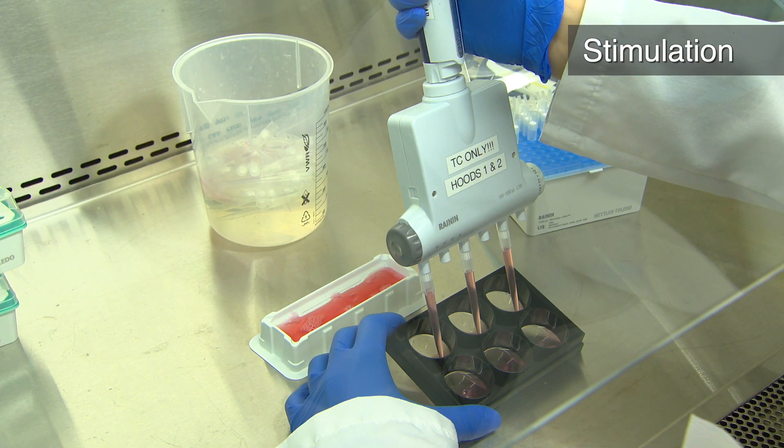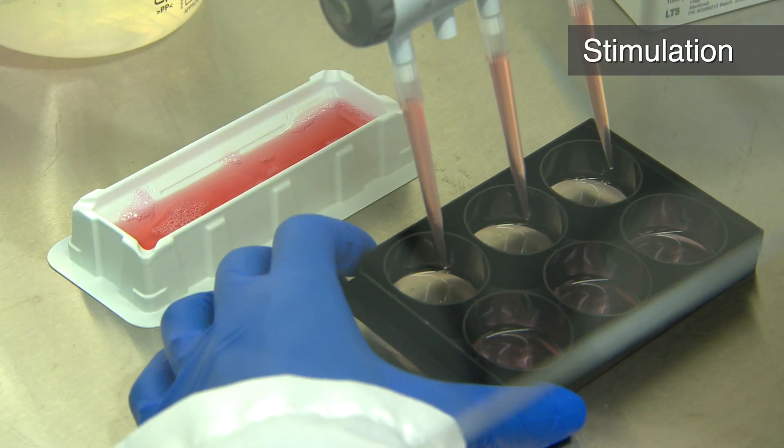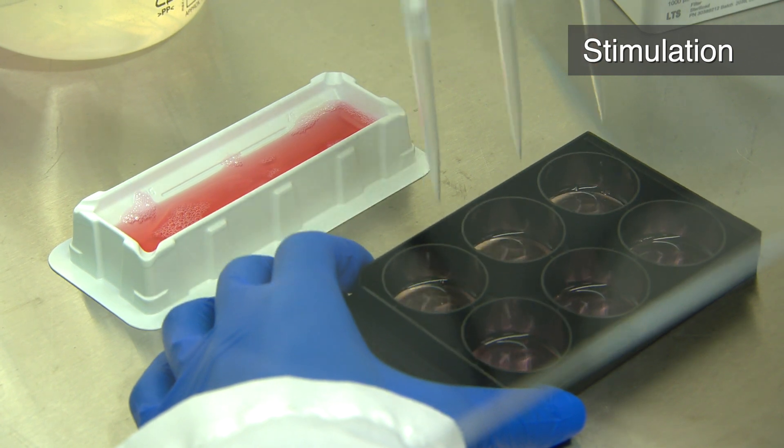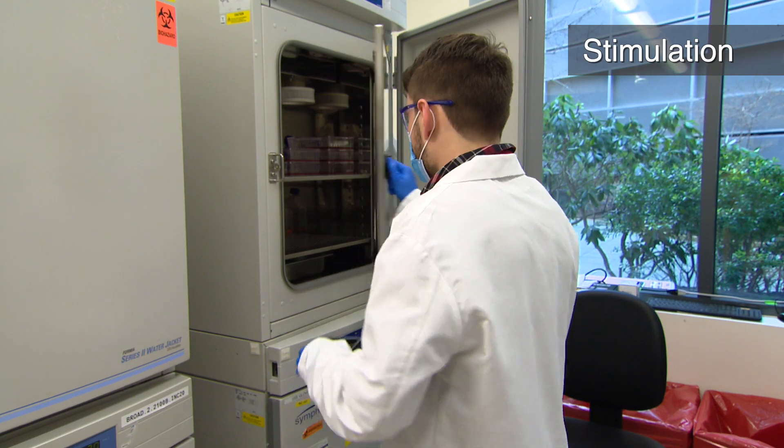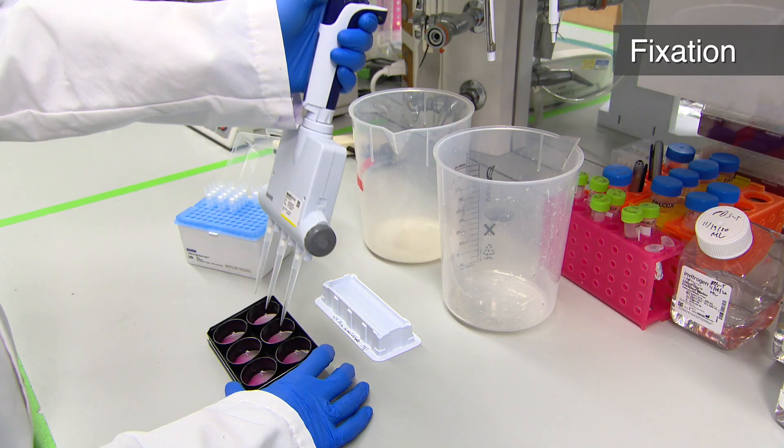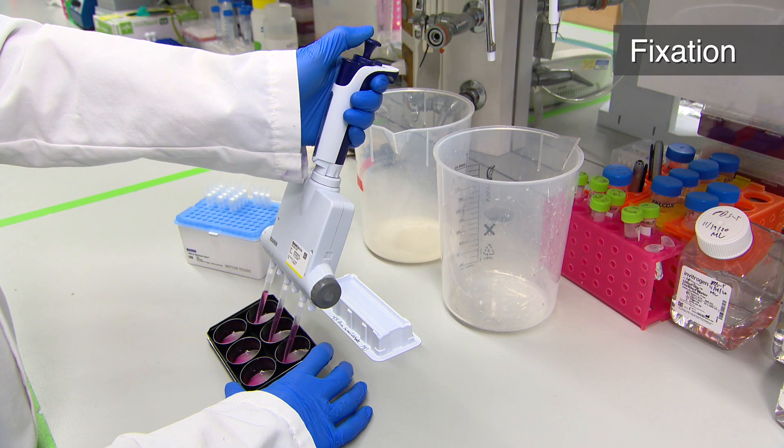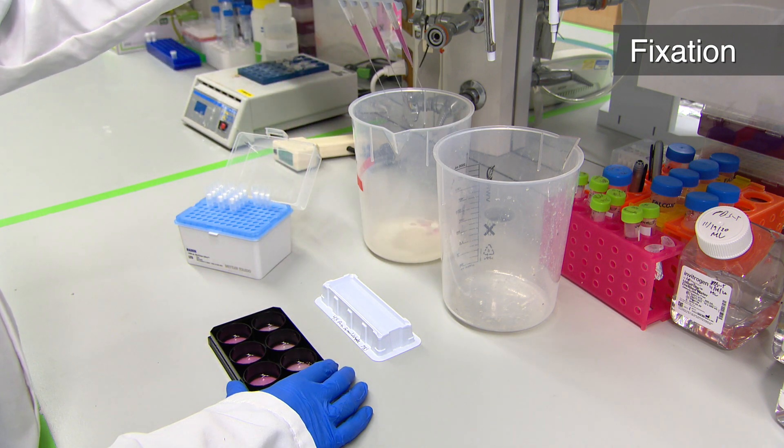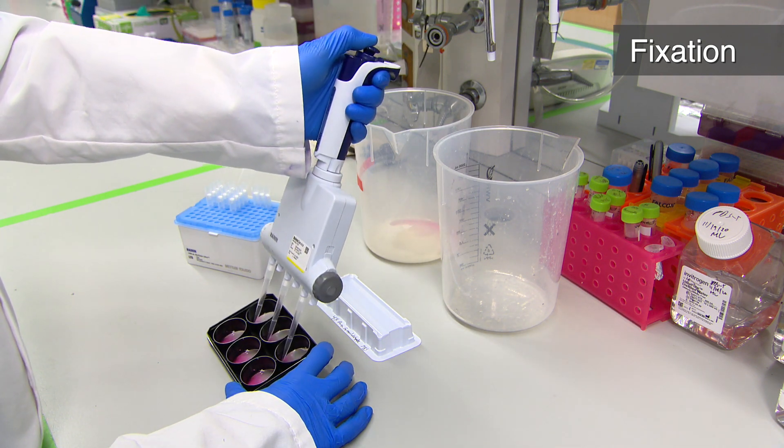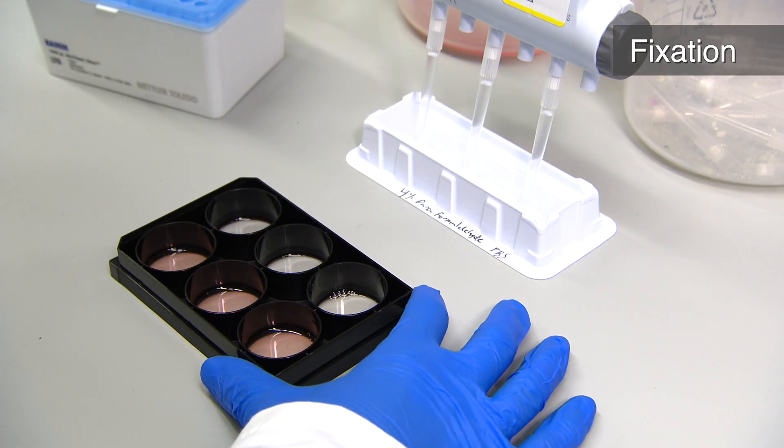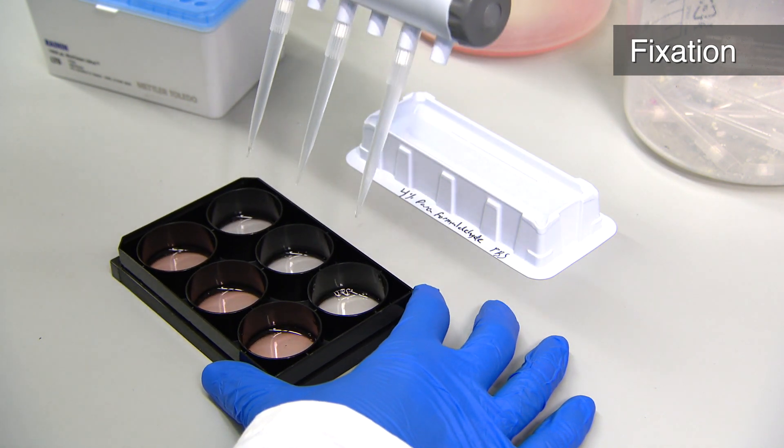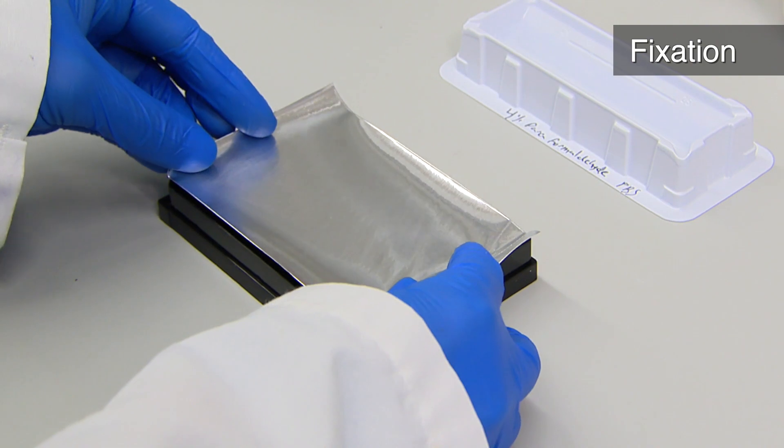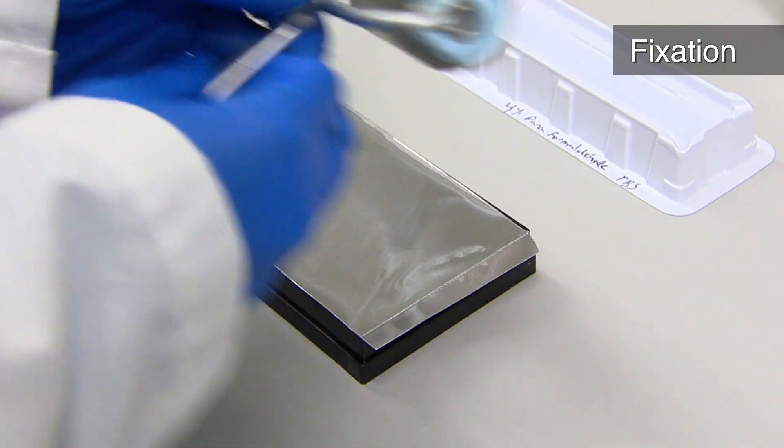Next, remove the media, stimulate cells with 2 milliliters media containing either TNF-alpha or IL-1 beta and incubate at 37C for 40 minutes. Remove media and fix with 4% paraformaldehyde in PBS for 30 minutes at room temperature. When adding liquids to the plate, pipette gently against the side of the well to avoid displacing the cells. When finished, cover the plate with a foil lid to shield from unwanted debris.